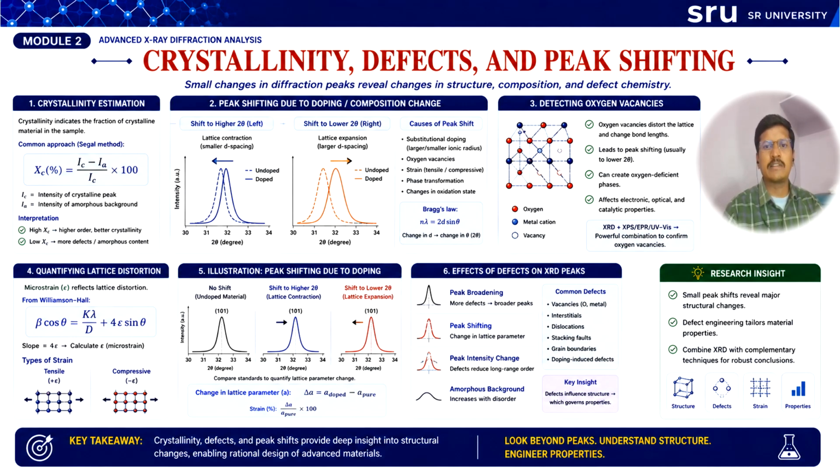The different defects influence diffraction patterns differently. For example, lattice dislocations increase the strain broadening. Stacking faults alter the peak symmetry. Grain boundaries contribute to peak broadening, and amorphous regions reduce the peak intensity. It means within the crystal structure, some particular region of space may be amorphous.